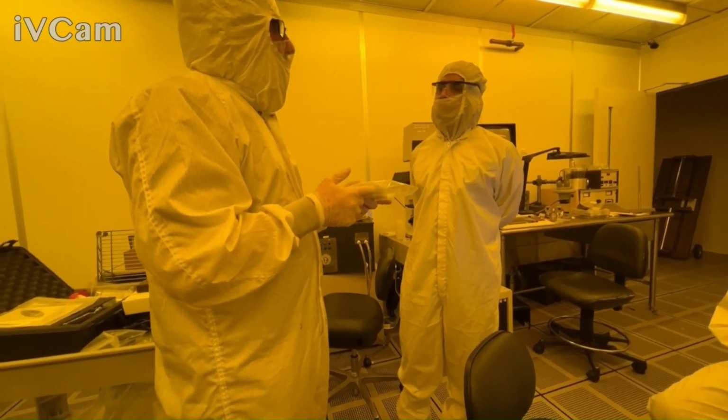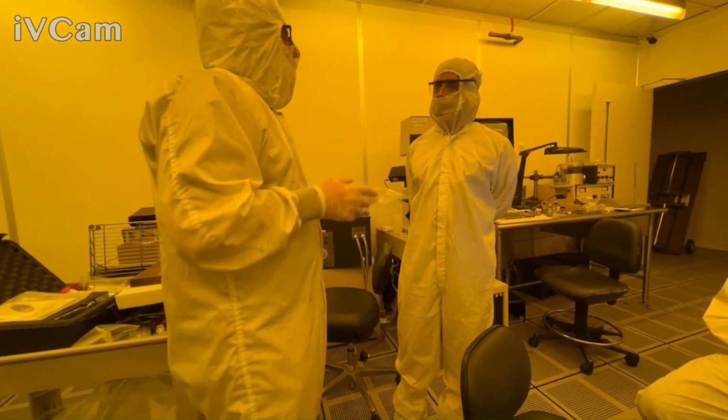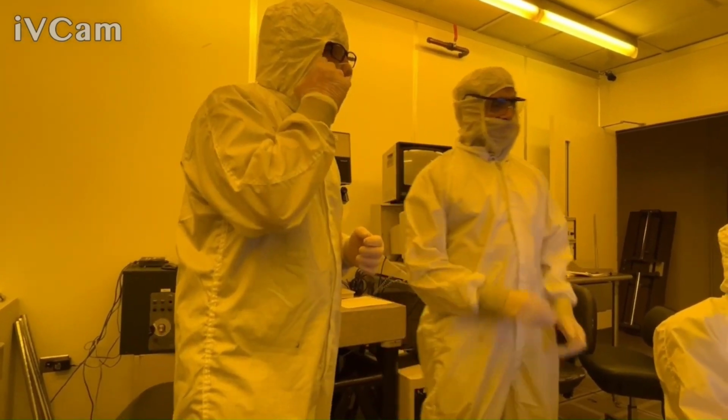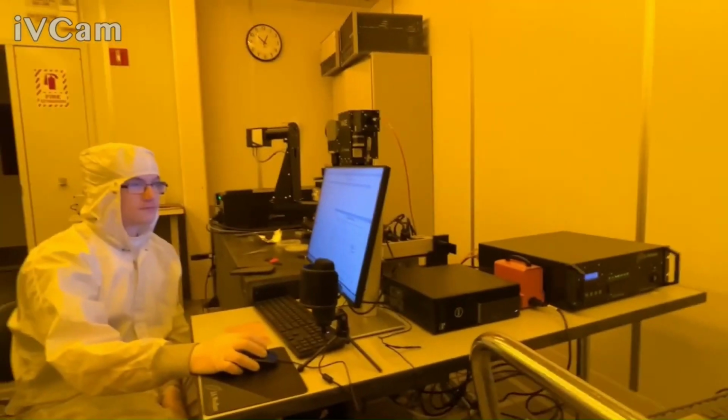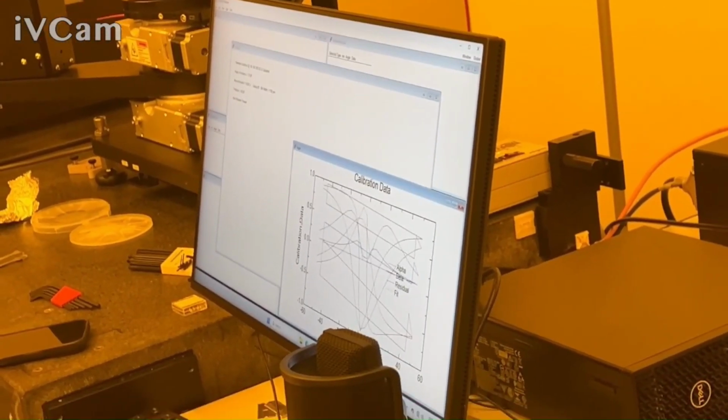So if you're doing that, you can break up that wafer and try it on. If you want to test it, that's the difference. So this is successful. So again, it should be, unless we put the wrong sample on there, or the lamp was off, or something was really weird.